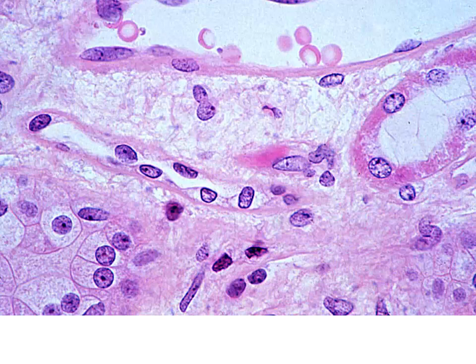Now, continuing in our look through the medulla, we're looking at a sort of weird section through a collecting duct, and that's what this tangential material here is going to be. We don't see the lumen of this at all.